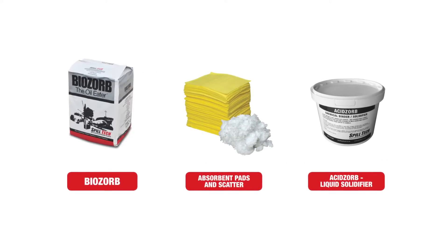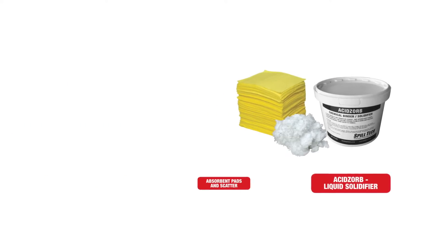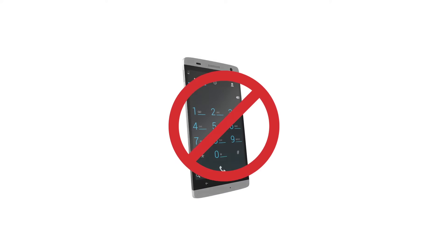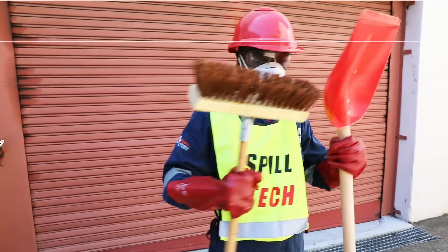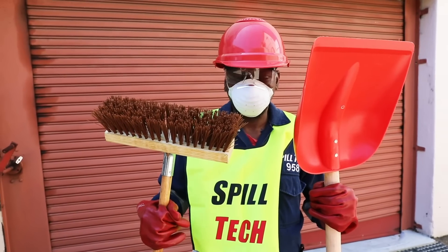Some substances such as alcohol and other chemicals may be highly flammable and can be set off by the smallest spark. Did you know that the static from your cell phone can ignite the fumes? This is one of the reasons our spill kits contain non-friction spades and brooms.